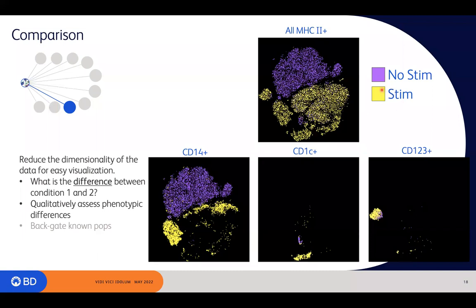I have files that have been stimulated with a toll-like receptor agonist, and then I, of course, have files that have not been stimulated, and I simply gated on the two conditions after I labeled the files, and then overlaid those gates in the layout editor here, and you're just looking at the two different conditions in UMAP or t-SNE space. So here you can see that the non-stimulated cells occupy what appears to be the northern half of this map, right? And then the stimulated portion, a bunch of other cells on the southern half.